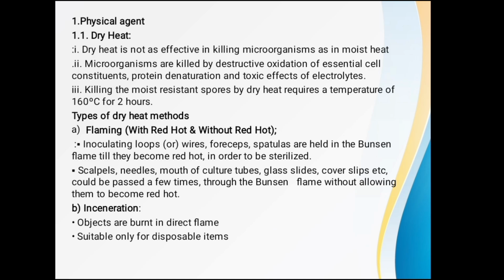Flaming: with red heat, without red heat. With red heat, inoculating loops, wire, forceps, spatulas are held in Bunsen flame till they become red hot in order to be sterilized. Without red heat, scalpels, needles, mouth of culture tubes, glass slides, cover slips, etc. could be passed a few times through the Bunsen flame without allowing them to become red hot. Incineration. Objects are burned in direct flame, suitable only for disposable items.